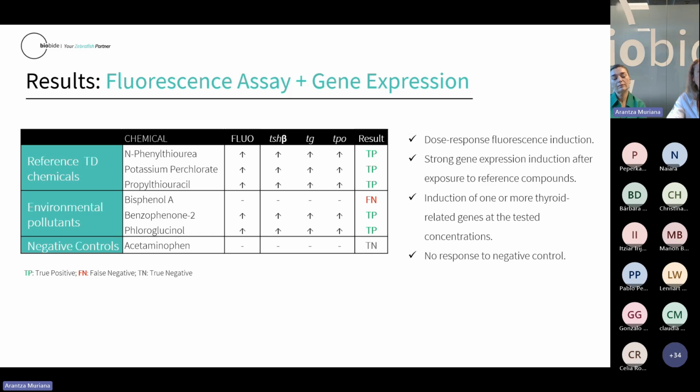So we can partially classify them as true positive. Our only false negative is bisphenol A.